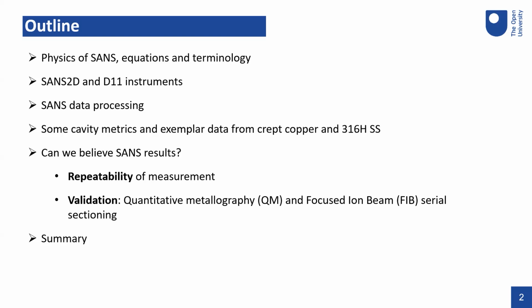Then comes the question of whether we can really trust the data, and we will question the data. To answer this question, we looked at the repeatability of the measurements, and we also tried to validate the data against two other techniques, quantitative metallography and focused ion beam tomographic sectioning. I'll finish my presentation with some remarks and takeaways for today.